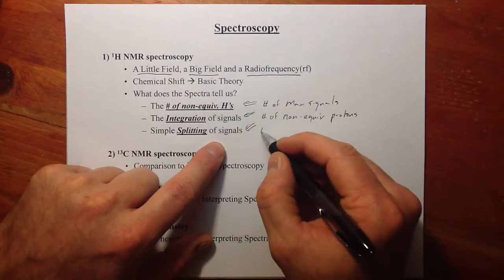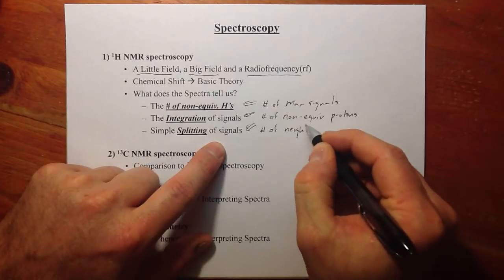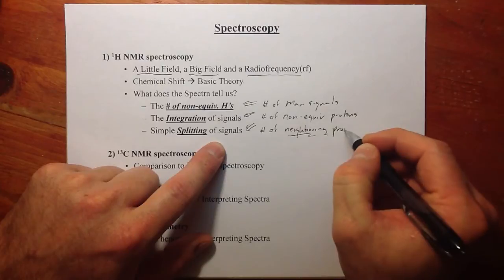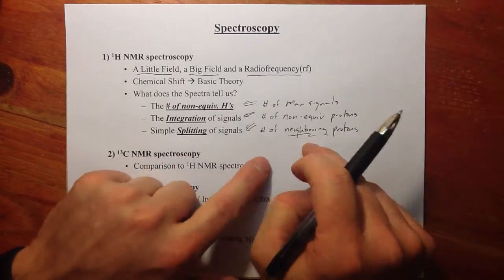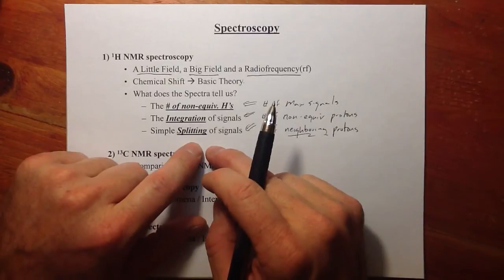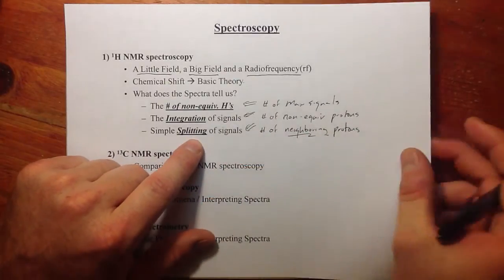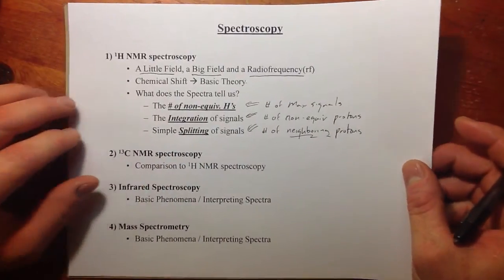Then the splitting of the signal is going to tell us something about the number of neighboring protons. It's not going to be about you, but about your neighbor, the neighboring protons. We're going to find out something about the number of neighboring protons by the splitting of a signal for that particular proton. So this splitting will talk about the neighboring protons. That's going to be in the 2nd, 3rd, and 4th videos. Let's go ahead and look at just NMR spectroscopy, the play itself.